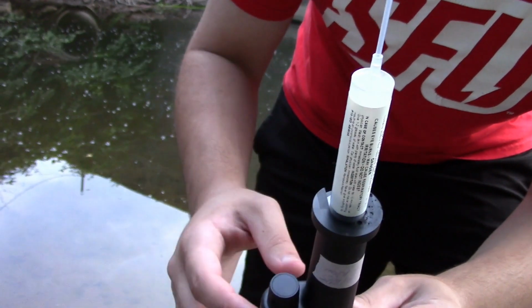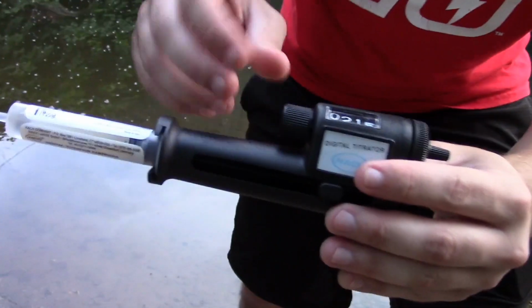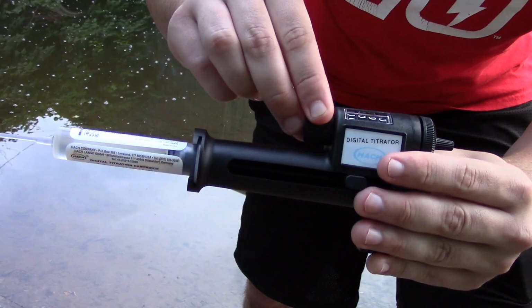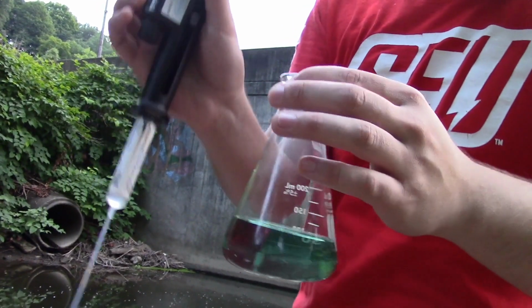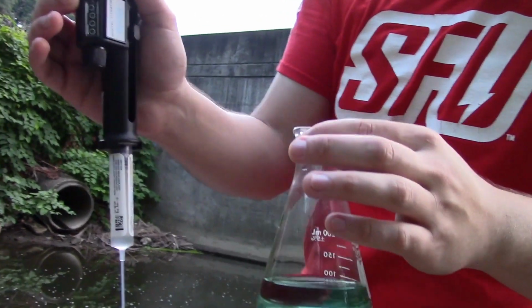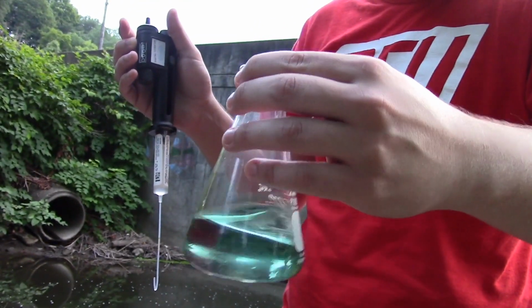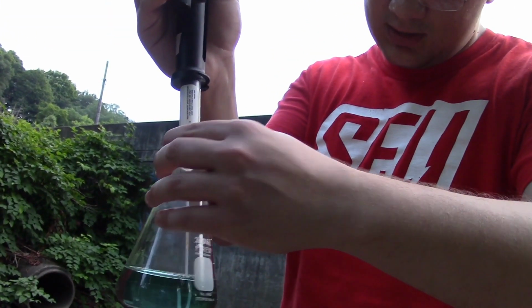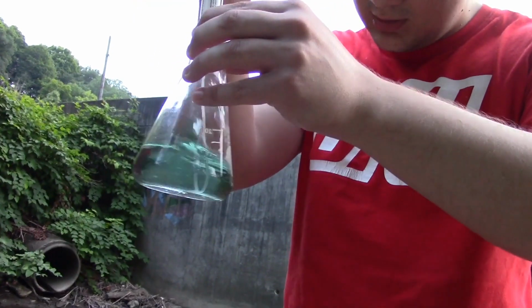So once we have it dripping out a little bit of acid, then we know at that point that we can finally zero it, and we'll be ready to start the actual test. Alright, now let's actually start the titration. Notice how I'm holding this stuff. I'm holding this all so I can operate this with one hand, while at the same time I have one hand holding the flask so I can shake this as I'm titrating. So we're going to insert this into the solution, and now let's start releasing some of this in here.